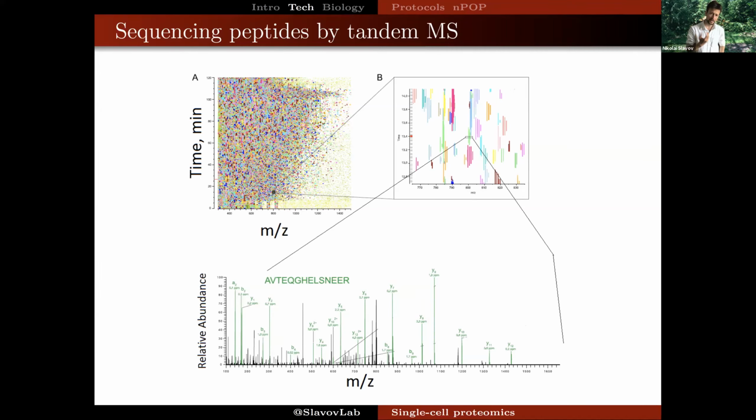So detecting the mass of a peptide ion with arbitrarily high accuracy is insufficient to determine the sequence. So to determine the sequence and therefore link to biology, what we need to do is break the peptide into pieces. And the breakage happens at peptide bonds. So by measuring the product ions of this breaking up of the peptide, we are able to determine the peptide sequence. Just giving you a notion of generally how mass spectrometry works.